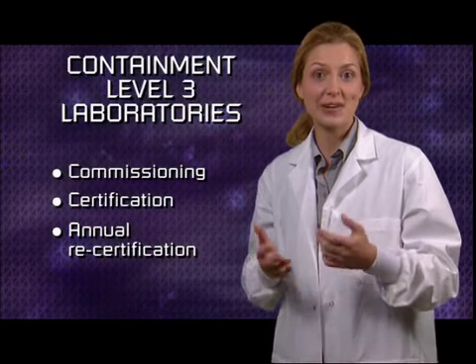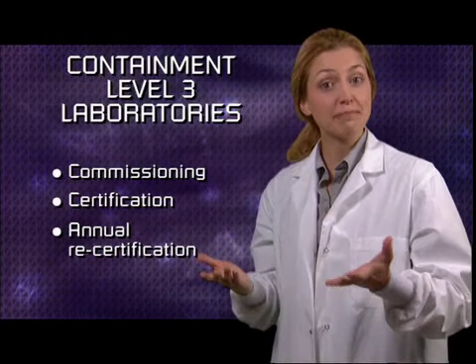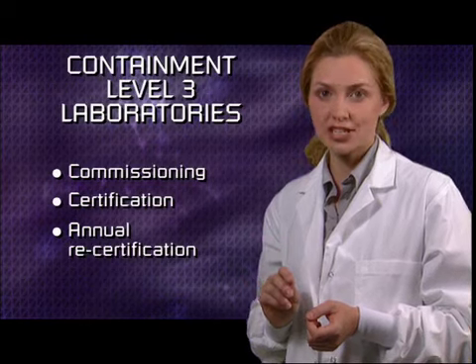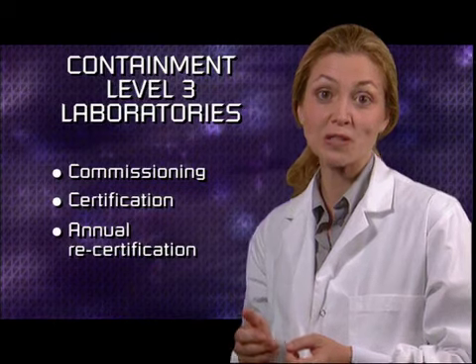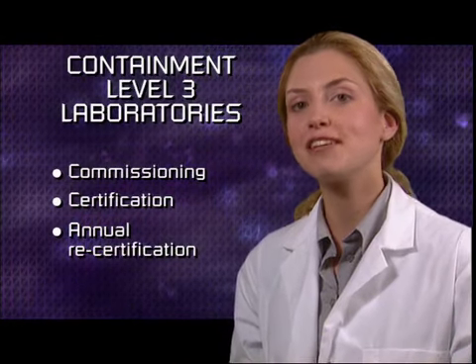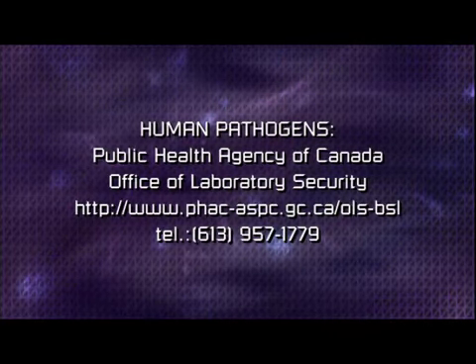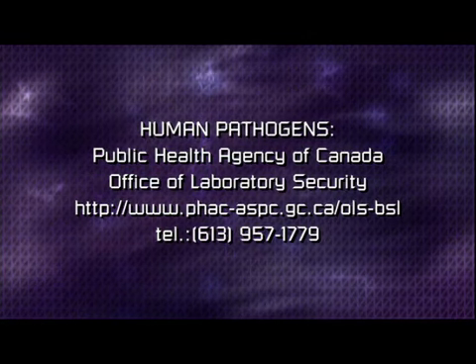Here are the regulatory aspects of Containment Level 3 lab design and operation. Newly built or renovated Containment Level 3 labs must first be successfully commissioned and then certified to ensure the facility and operational protocols meet the requirements prior to commencing work with infectious agents. Once in operation, all Containment Level 3 labs must be recertified annually. If you have any questions regarding biosafety, please contact us or the biosafety officials in your area for further details.